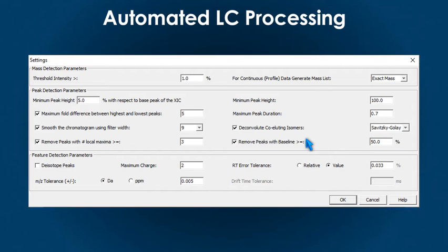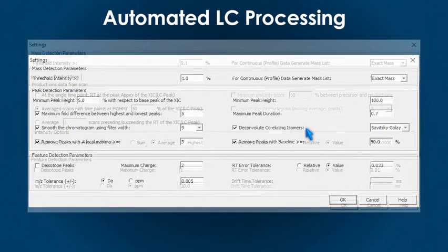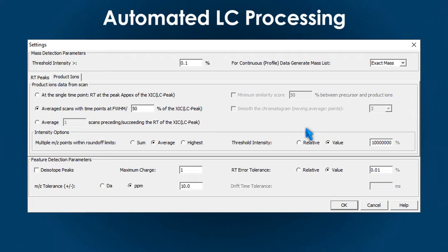To resolve isomer peaks, you can use our supported deconvolution algorithms. Also, SimLipid offers customized DIA-compatible data processing parameters.